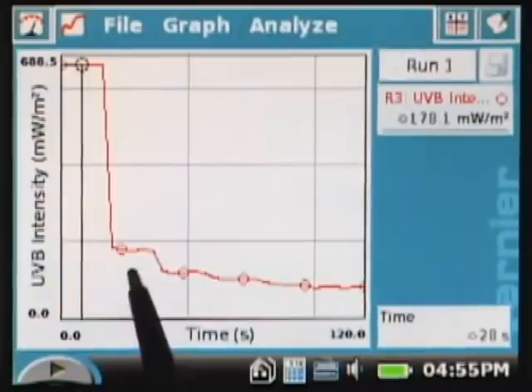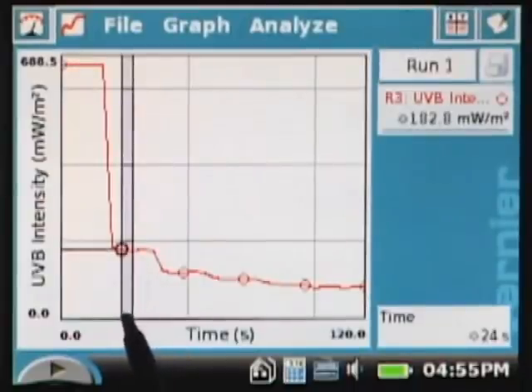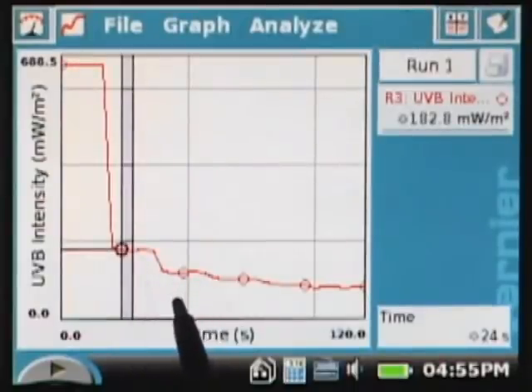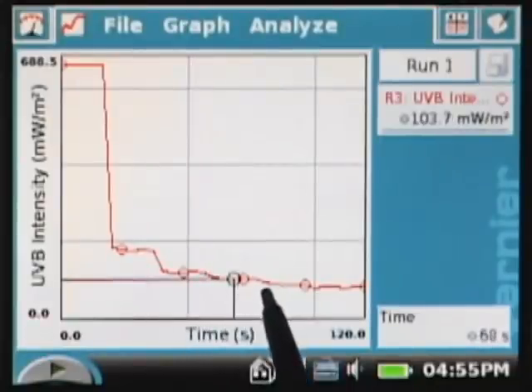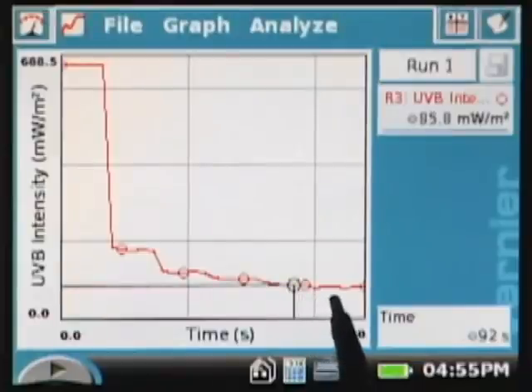When we go down to the first sunscreen, which was a UV4, it drops by quite a bit. When we went into the 8, it drops by quite a bit more, and then for all of the subsequent runs it drops, but not nearly as dramatically as it did during that first one.